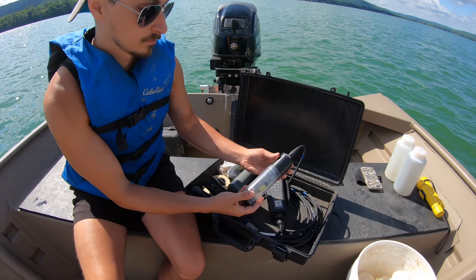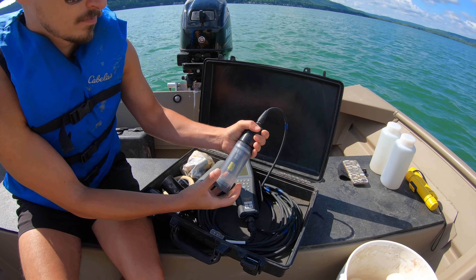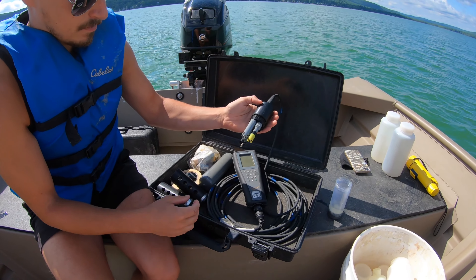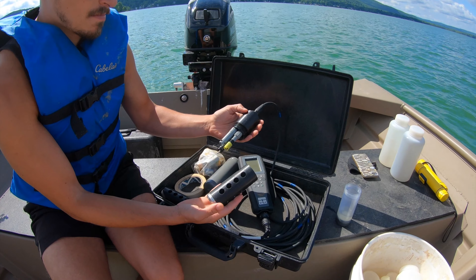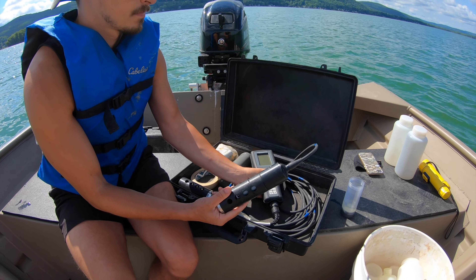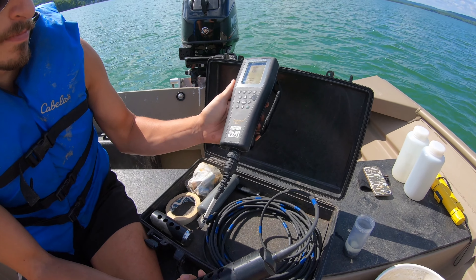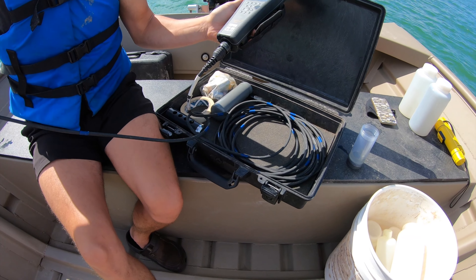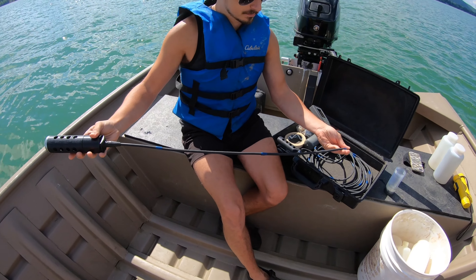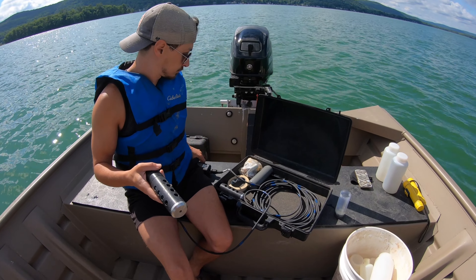Matt's going to show you some parts of this. We have the sonde, which tells you what's going on in the water — it sends all the information through the cable to the handheld. There is a cover on it. You need to make sure that all the probes stay moist throughout the year when we're using it. This is the cover we're going to use to put in the water. Matt's going to put that on. There are blue markings on the cable in feet to help us track depth as we go down, since the handheld does not give us depth. We know we're about 39 feet here.